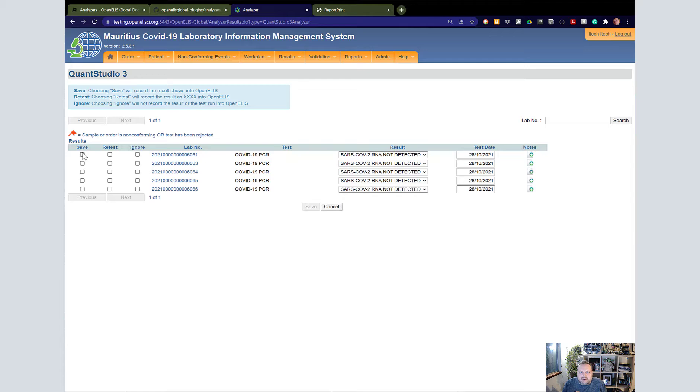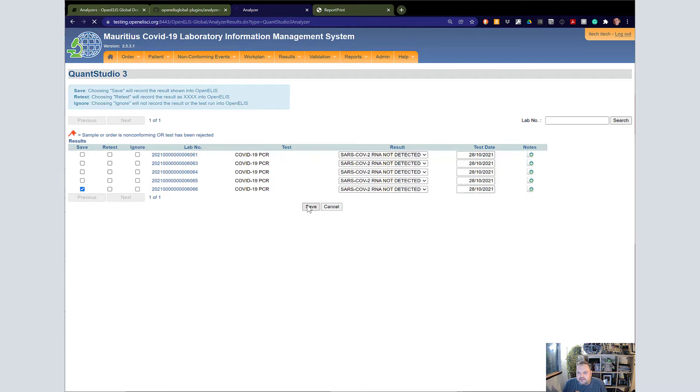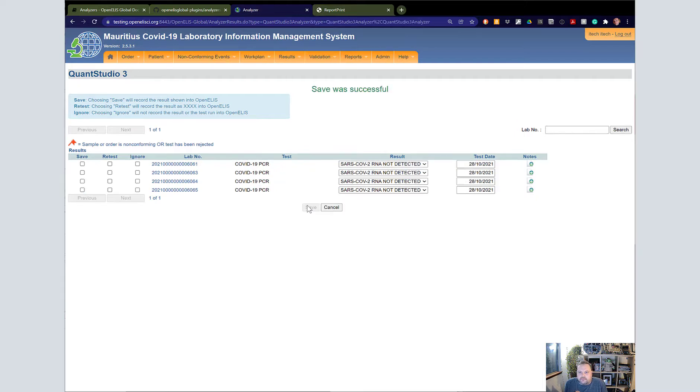You can click Save on all of these, and then the result is recorded in OpenAlice. So I'm going to go ahead and save for the one that we'd set up, and that's it. The result has been saved and has been moved on to validation.